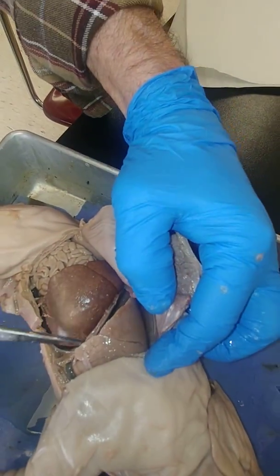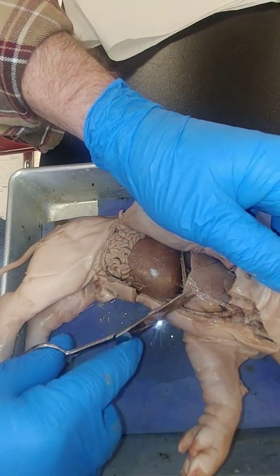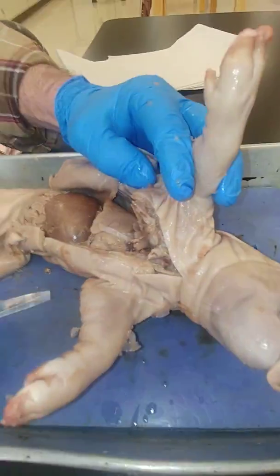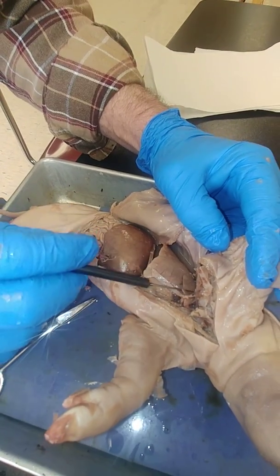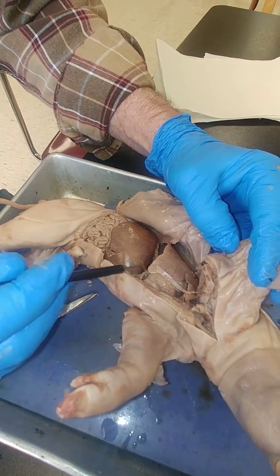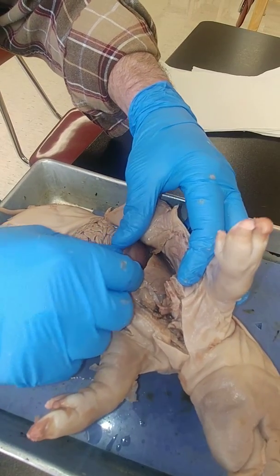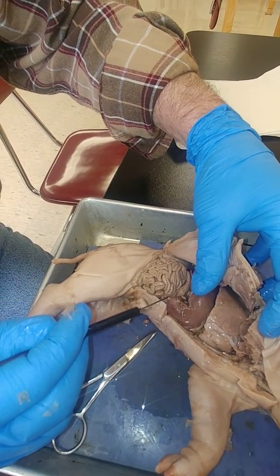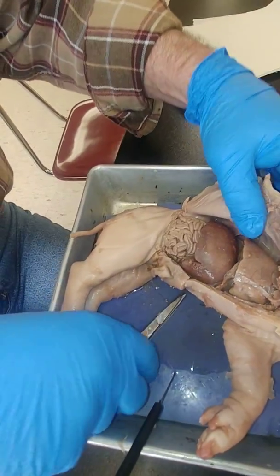Okay, what we have here is the dividing line between the peritoneal cavity down here and the pleural cavity up above here. So the pleural cavity is containing the heart, which is right here, and the lungs, right in here. Peritoneal cavity from the diaphragm, and that's how thin this muscle is right here, your diaphragm. But you've got your liver down here, and then underneath that is your stomach, and the small intestines here. And with the fetal pig, the large intestines are going to look about the same. We're going to finish trimming here a little bit more.